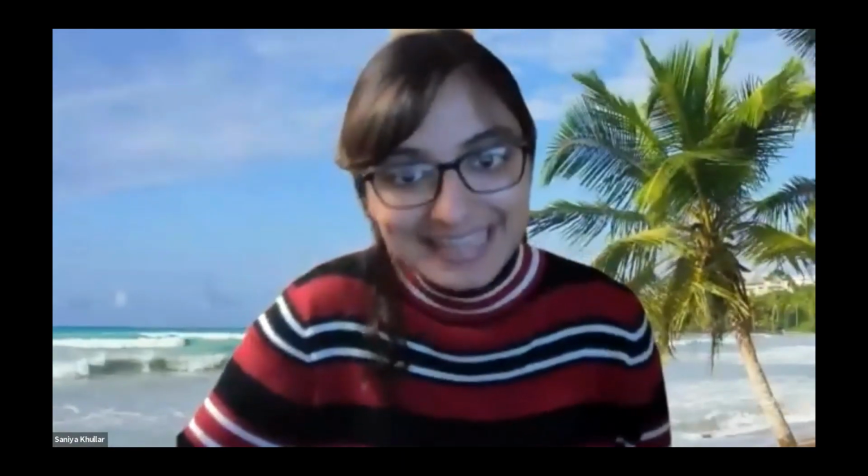Hi everyone, I am Saniya, and in this video, I'm going to show you how you can overlap genomic regions using the GRanges or GenomicRanges package on Bioconductor in R. So if you have two regions of DNA and you want to find if there are any overlaps, how do you do that? This is something that is super important as well, and I think that this will hopefully help you guys.